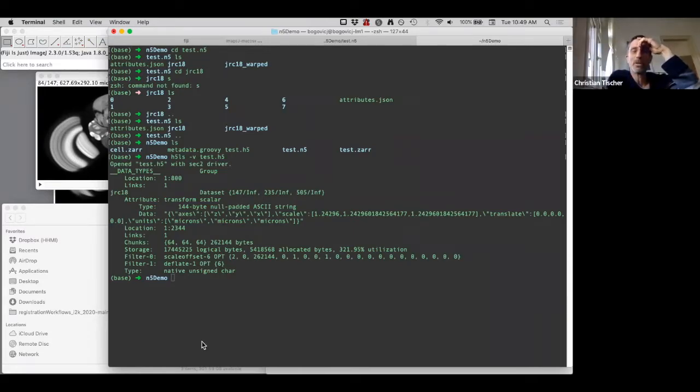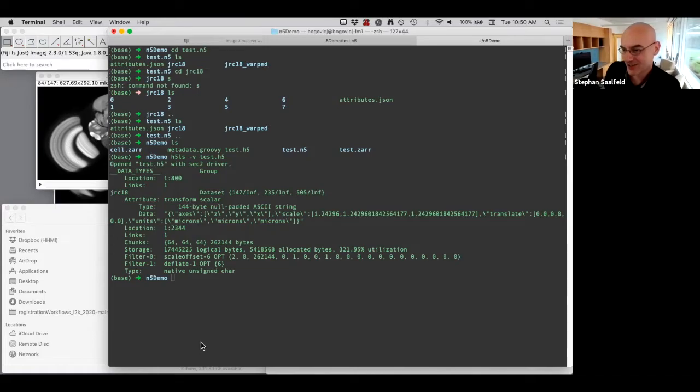What Matt brought up several times, and you said it now again, is that maybe we don't want to have everything in pure JSON, but some scaling factors maybe as a float array or something, right? And that's what the HDF5 backend is currently doing. For everything primitive, for everything array, it's using primitive or array. And as things get more complicated, it just JSON-strings it. And from outside through the API, you don't really notice this.